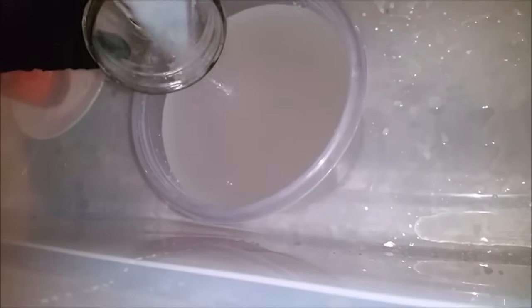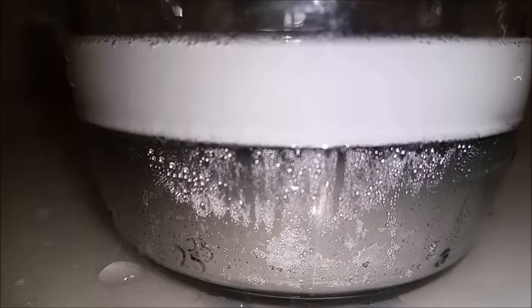Now that I've gotten rid of all the salt I can go ahead and let it sit with a little bit of fresh water on top of the mercury. The sodium which is dissolved in the mercury will now react with the water forming sodium hydroxide and hydrogen gas that you can see bubbling out here.